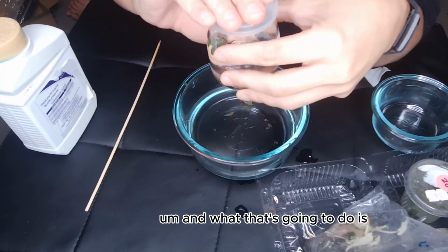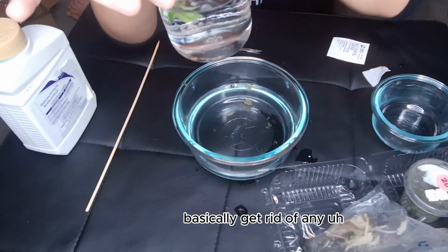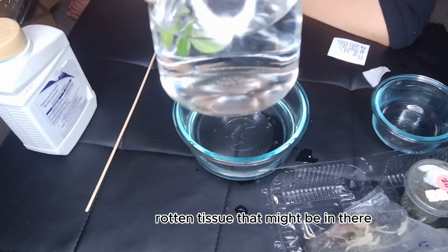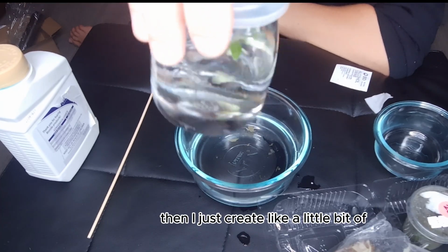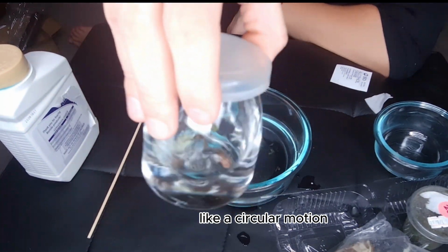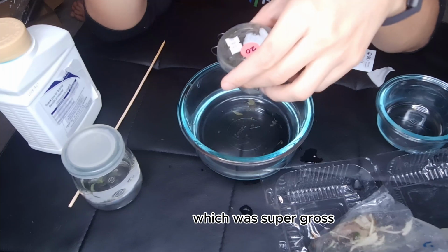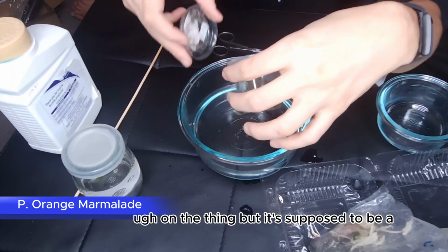And what that's going to do is basically get rid of any rotten tissue that might be in there, so like growing. And then I just put in one of these flasks, and then I just create a little bit of a circular motion, which was super gross on the thing.